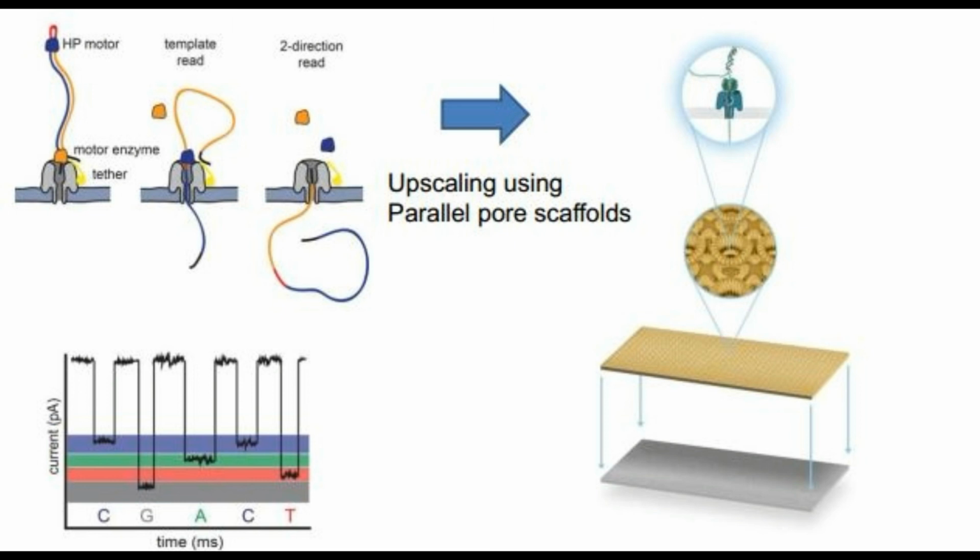Compared to the other enzymatically driven sequencing chemistries, nanopore sequencing requires only a single processing enzyme. In this case, a helicase sits on the sticky end of the DNA strands to unwind the DNA, and upon contact with the nanopore protein, this helicase activates and starts to unwind the DNA through the nanopore.